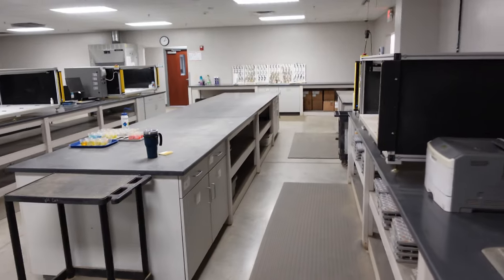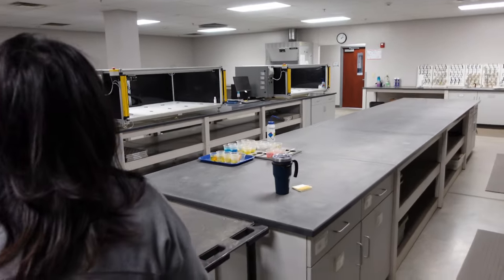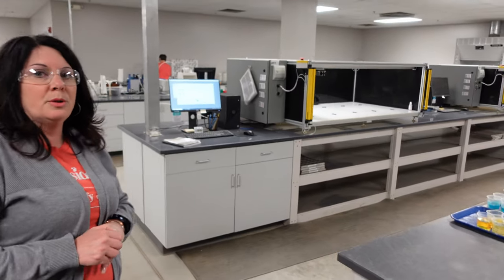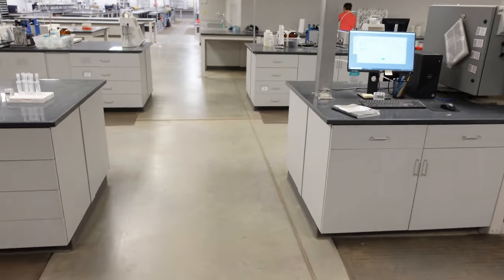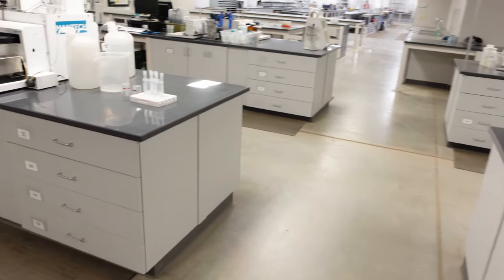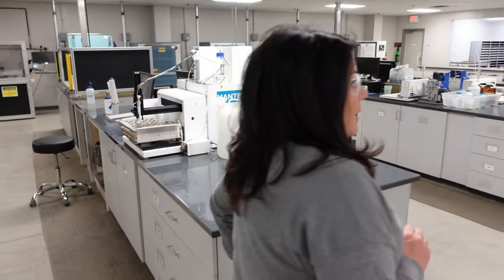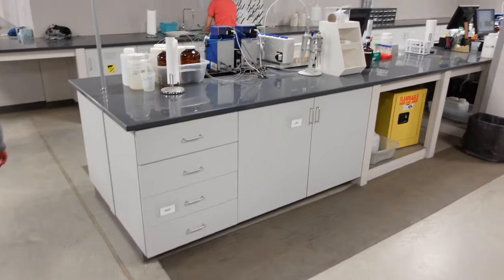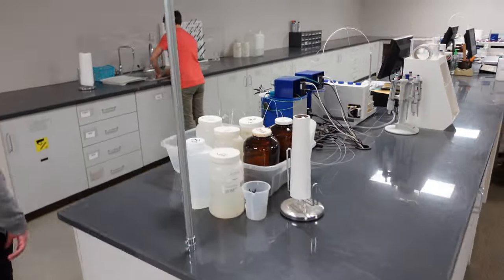This instrument room also has our flow injection analyzers, where we do the Bray 1, Bray 2, and Olsen phosphorus work, as well as our available nitrogen, ammonia, and chloride. This flow injection analyzer is currently running. We'll head into another instrument room where our ICPs are.